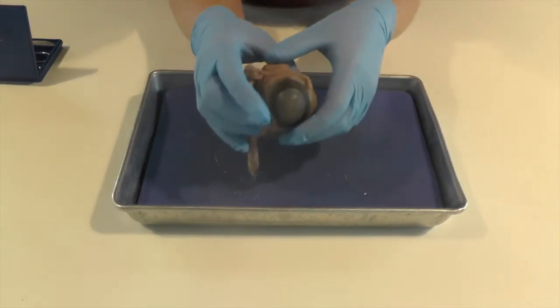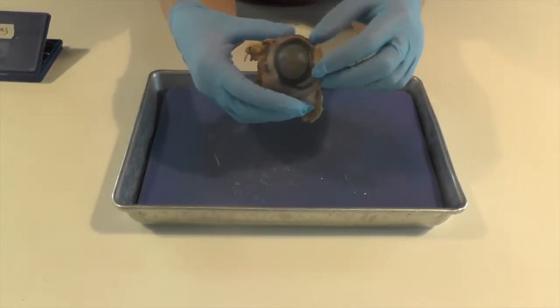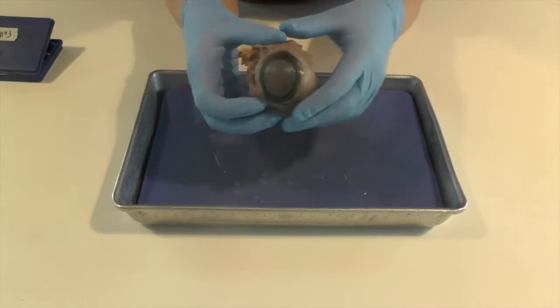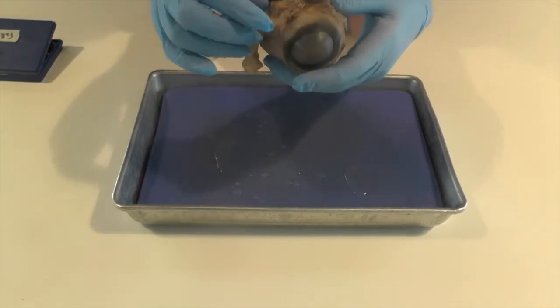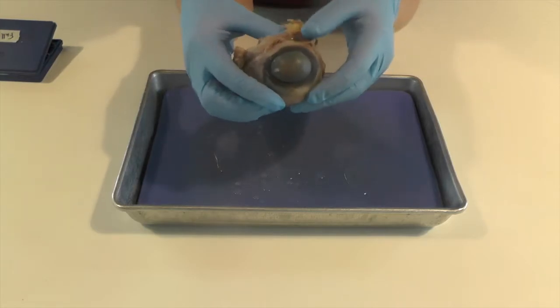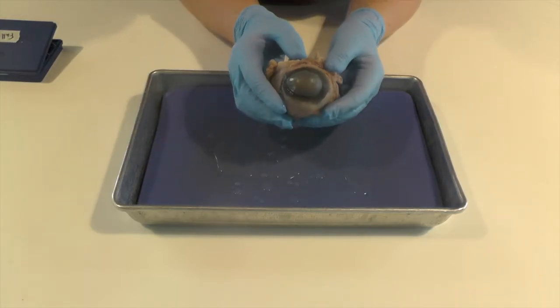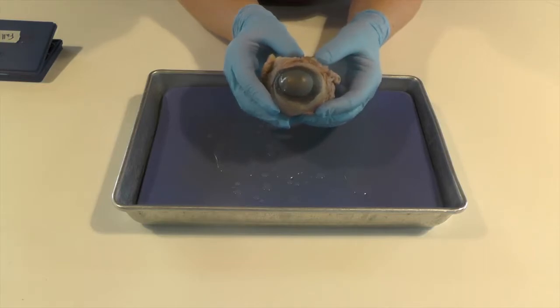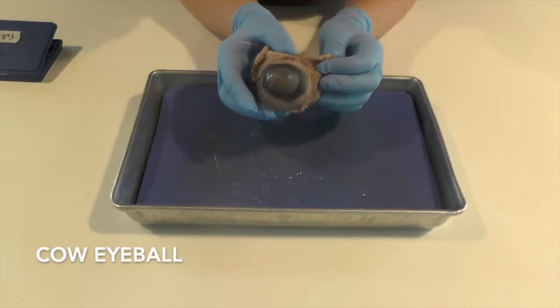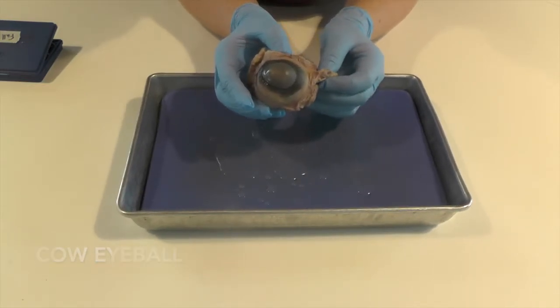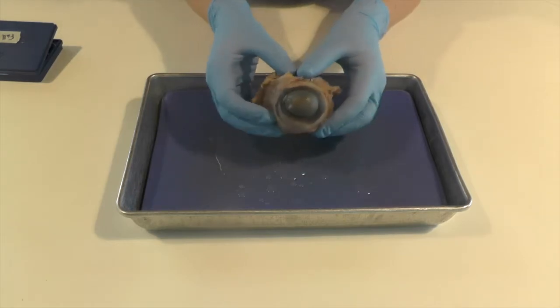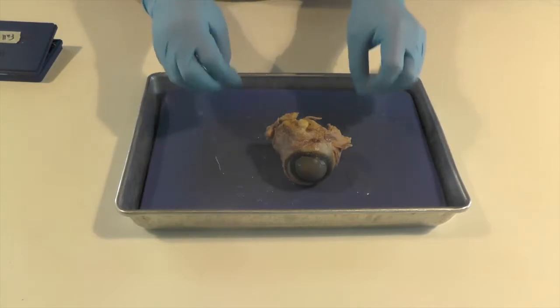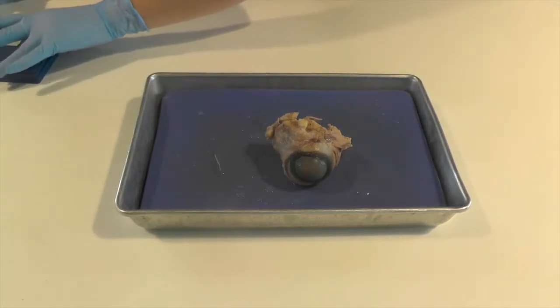So here we have a cow eye that we're going to dissect. Scientists like to dissect things to get a better understanding of how things work. We do not have a cow farm here at Spectrum. We order them from a company that sells things to science museums, scientists, and labs.